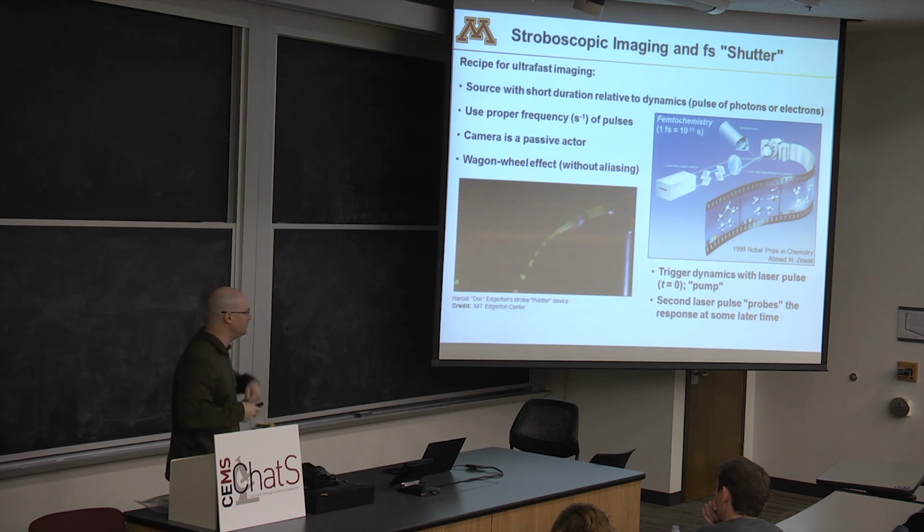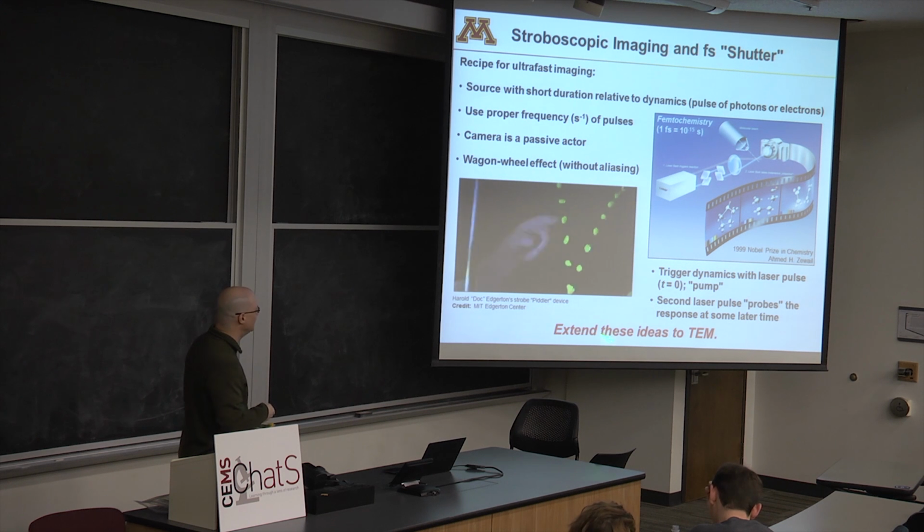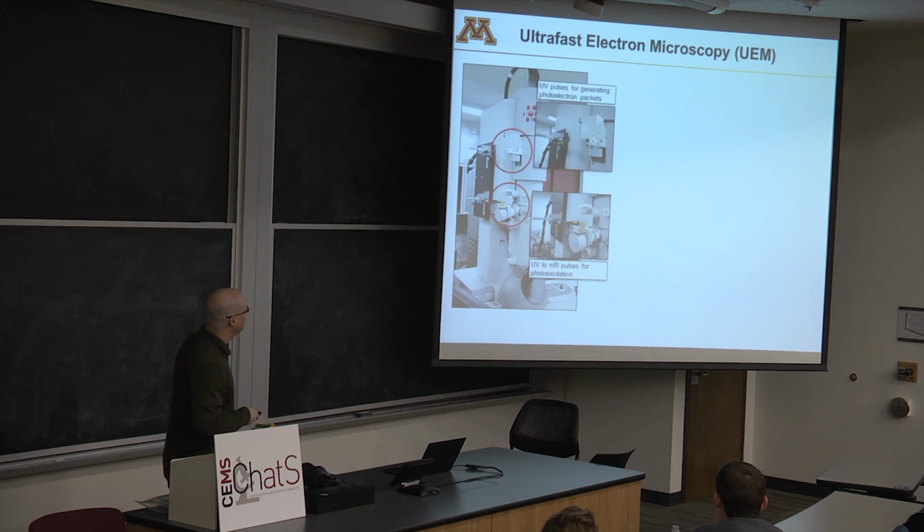And there's scattering. There's all kinds of things you can do with it, okay? And so with that, you could actually get down to the time scales that molecules react, and you could figure out actually how they change in space and time. Pretty cool. So we're going to steal these ideas. So how do we do that? Here's the TEM I already showed you. This is actually our TEM.